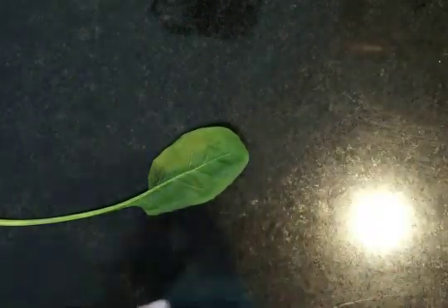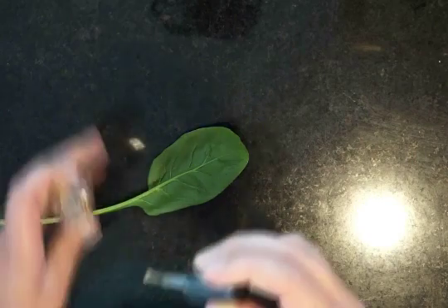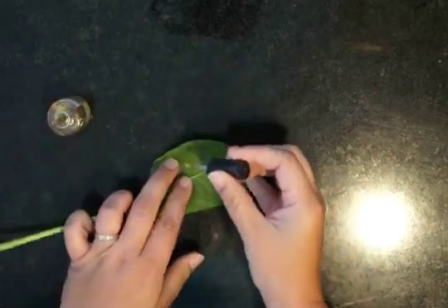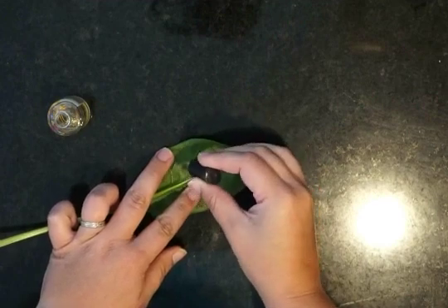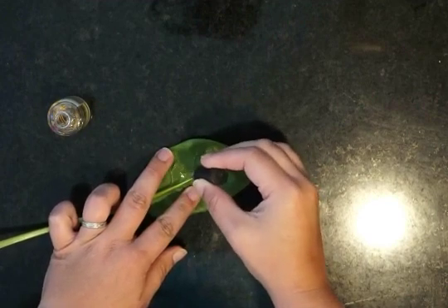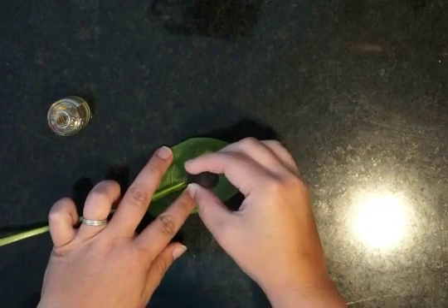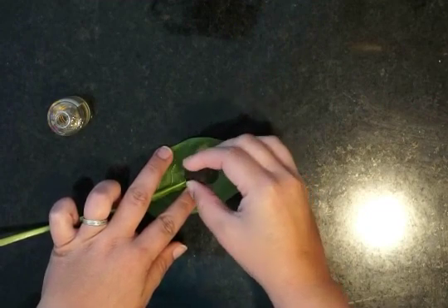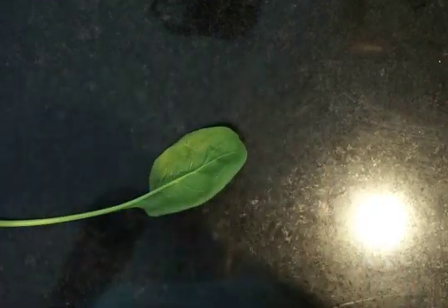The first thing you're going to do is flip your leaf over. You have to make sure that you are working on the back side, the underside of the leaf, and paint a small section of that leaf with the clear nail polish. You don't need to get it too thick — try to keep it a little bit thin, but cover it completely.